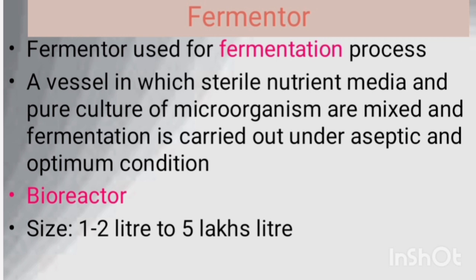So the fermenter provides optimum condition for the growth of the microorganism and also for the fermentation process. It is important for the growth of the microorganism and synthesis of new product. The size of the fermenter ranges from 1 to 2 liter to 5 lakhs liter, or occasionally up to 1 to 2 million liters are commonly used.